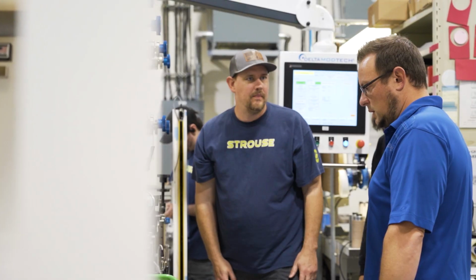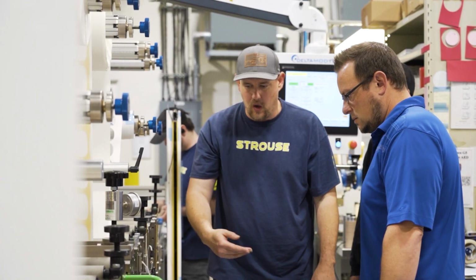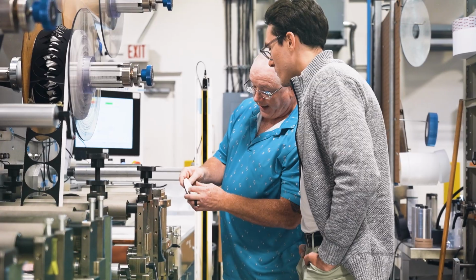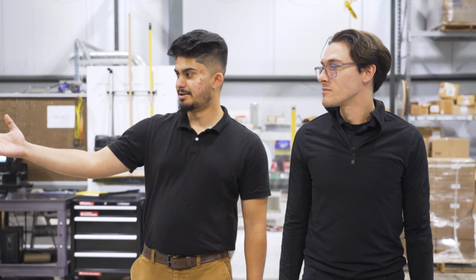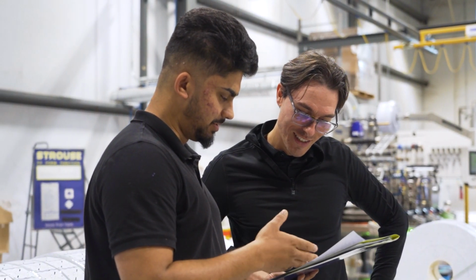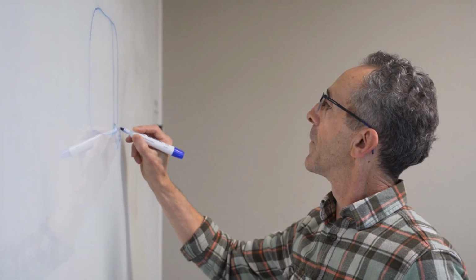Once you have selected potential materials, the next step is to evaluate the manufacturability of your design. That includes not just material performance, but how easily it can be fabricated and assembled into a final device. Partnering with a converter that specializes in medical grade and microfluidic parts is essential. It's not just about having the right materials, it's also about having the right support and expertise to take a design from a sketch to a scalable product. Getting samples, testing compatibility, and understanding the nuances of converting microfluidic components can all help prevent production issues down the road.